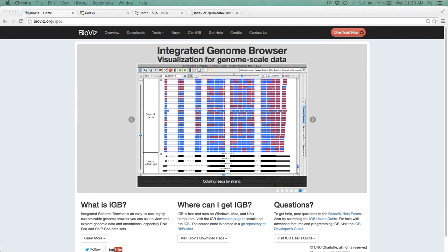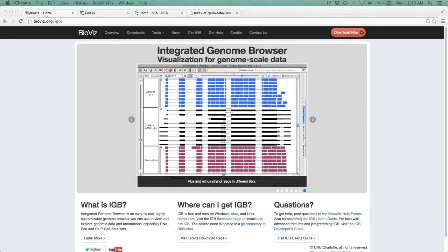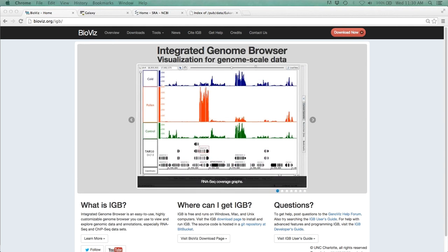Today, I want to cover how to find a freely available RNA-seq data set. We will then groom, quality check, and trim that data as necessary. Then we're going to use a program called TopHat to align the data to a genome, and finally we will visualize the data in IGBE and look at a few data analysis tools.